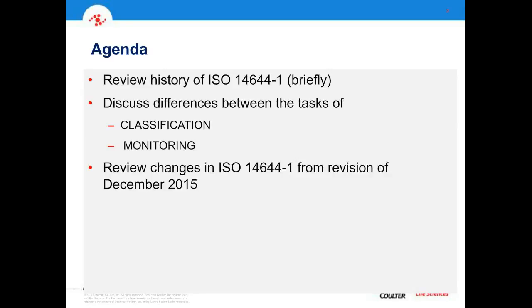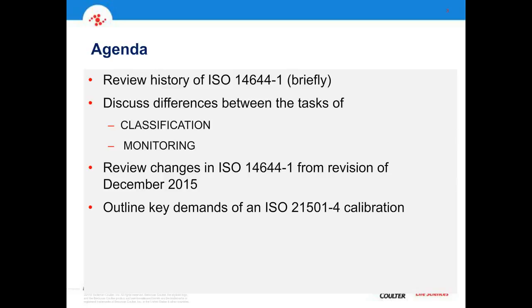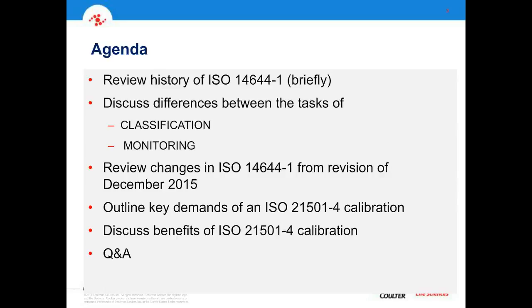Follow that with a review of the recent changes in the 14644 document that occurred this last year, effective in December, and to look at the demands that relate to 21501-4 calibration for airborne counters, not to go into it in great detail, but to address that and understand the impact or effect of that. Then we look at the benefits, and of course at the end have some further dialogue.